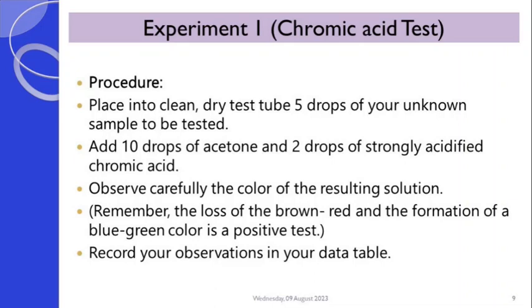When your brown-red chromic acid changes to the blue-green color, then there is a positive test, meaning that there is a presence of primary and secondary alcohols.